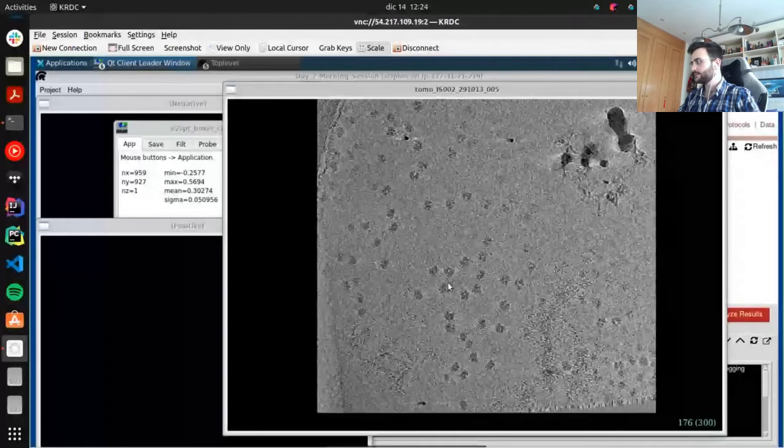Okay, so I'm going to start picking some. For those of you that are already here, you can pick some of them, at least 5. I usually like picking more. Yeah, probably you can follow what Pablo said. If you are using noVNC, you can use the menu on the left, and when you open the menu, there is on top a show extra keys, and then you can simulate the control. Probably that will help.